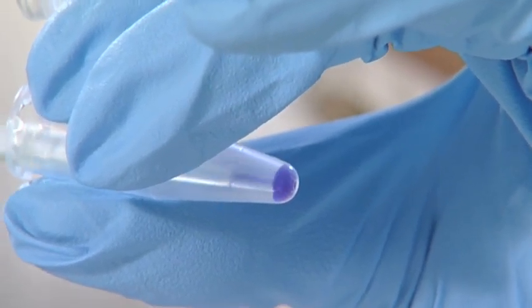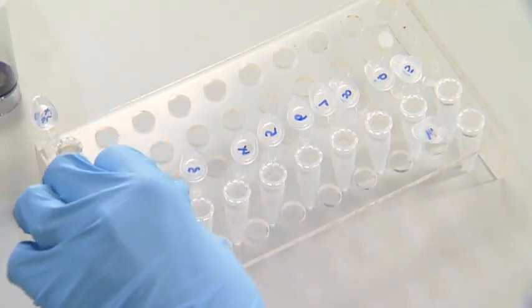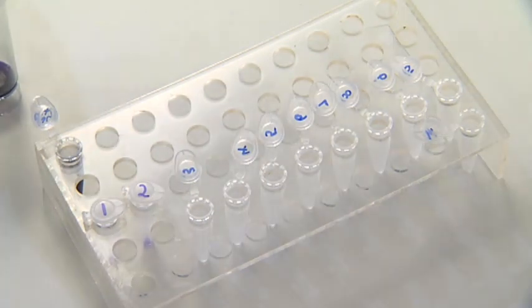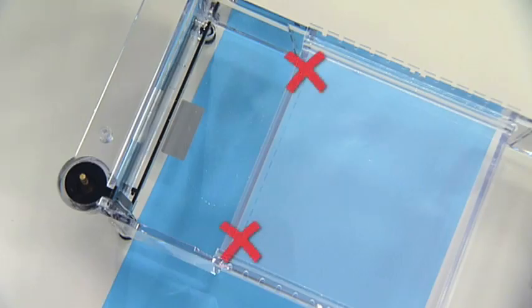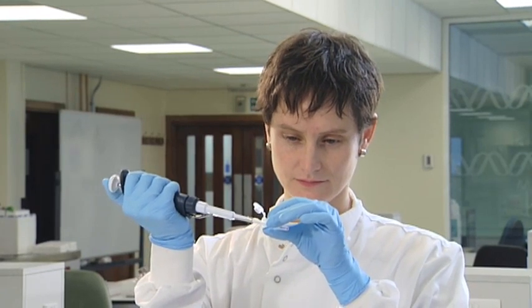Ensure the loading buffer and the sample are mixed so the solution has a uniform colour. Arrange labelled tubes containing samples in the same order that they'll be loaded into the wells. If there are more wells than samples, avoid using the outermost wells. Samples loaded on the edge of a gel tend to run less consistently than those loaded closer to the centre. The volume of sample loaded into the wells will depend on the capacity of the well — 10 to 20 microlitres is typical.